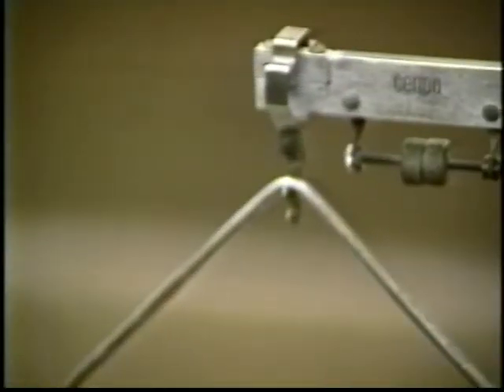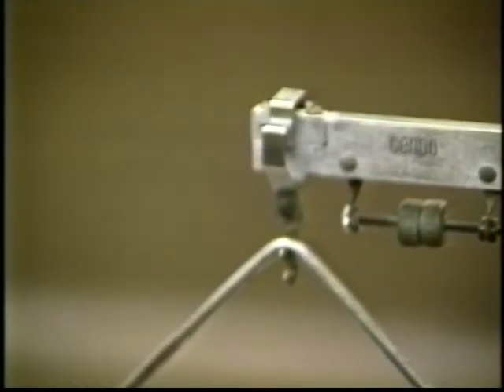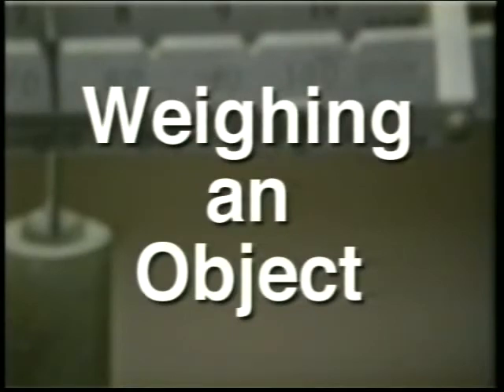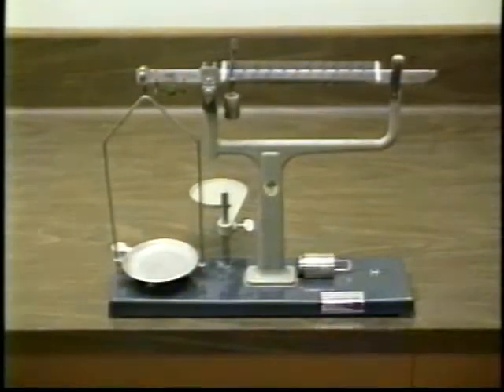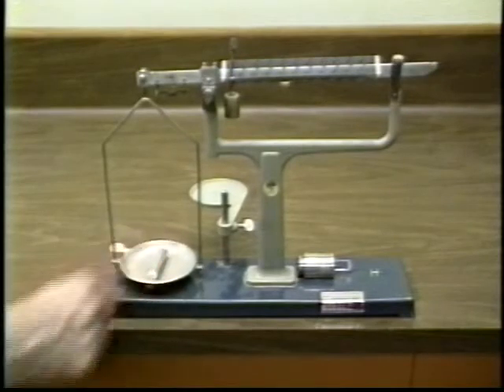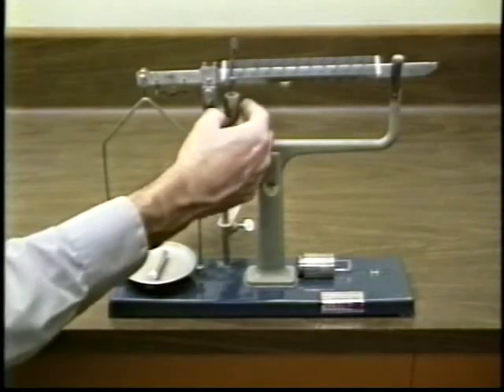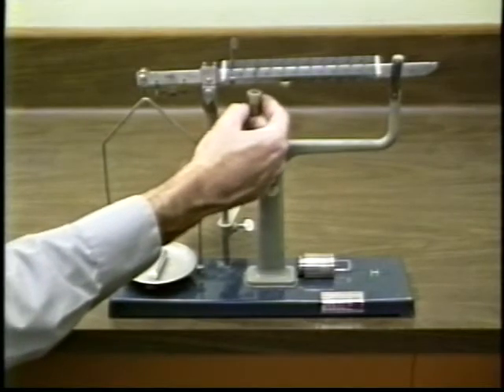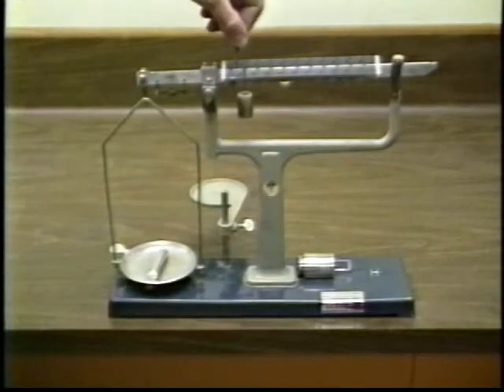Make sure that the pivot lock is pointed down and that the pan support is hanging on its knife edge. Carefully place the object to weigh in the balance pan. First, move the heavy slider as far to the right as possible without causing the right end of the beam to drop.